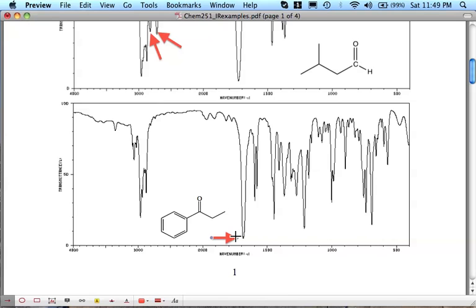Now, when we're looking at aromatic compounds, we have some other stretches that start to become distinctive. The first two spectra we looked at were just alkyl groups, so I want to point out the new ones. Now, these peaks right here, can you help me out and tell me what these are? I'm just going to put a little box around them. Those guys right there, I'll move it down to the axis so you can see where they are.